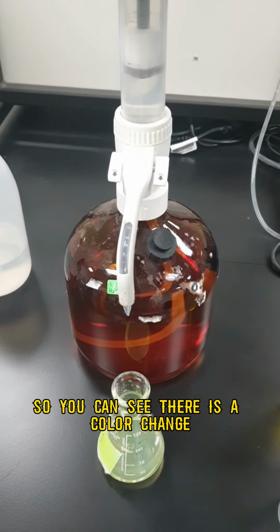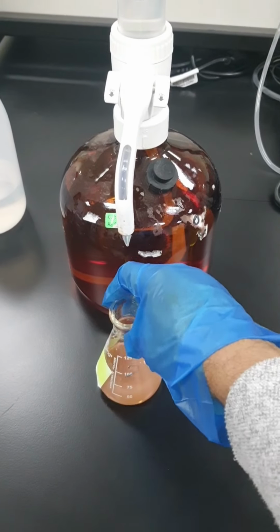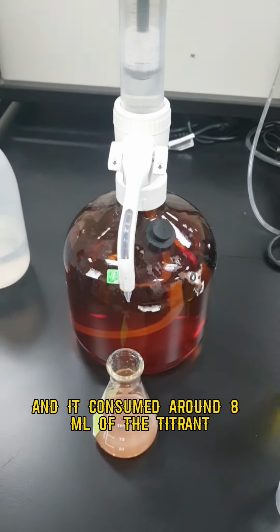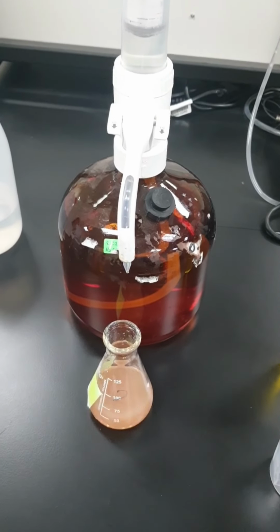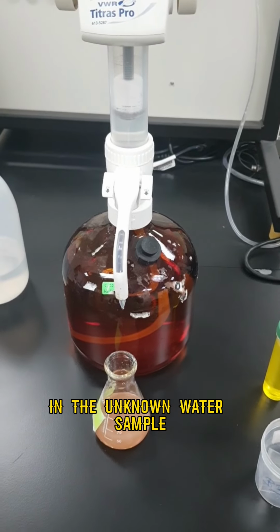So you can see there is a color change. Our final endpoint, which is brick red color, and it consumed around 8 ml of the titrant. Using a simple formula, we will find out the amount of chloride in the unknown water sample.